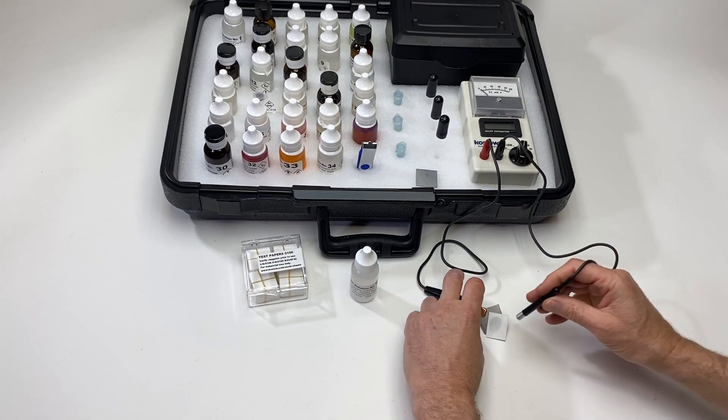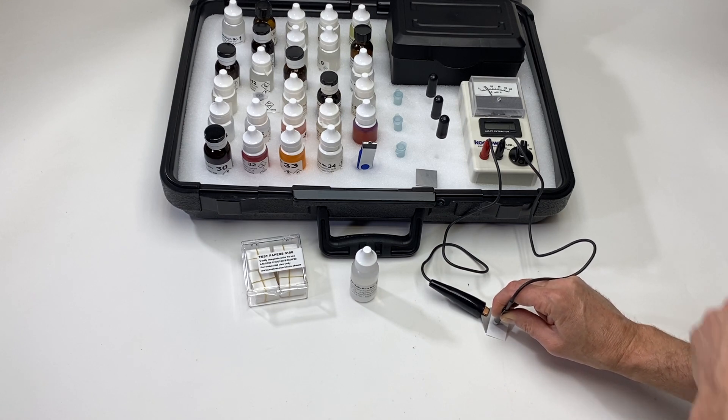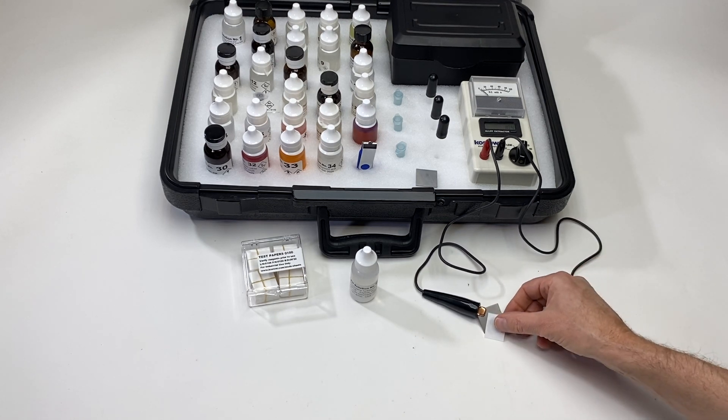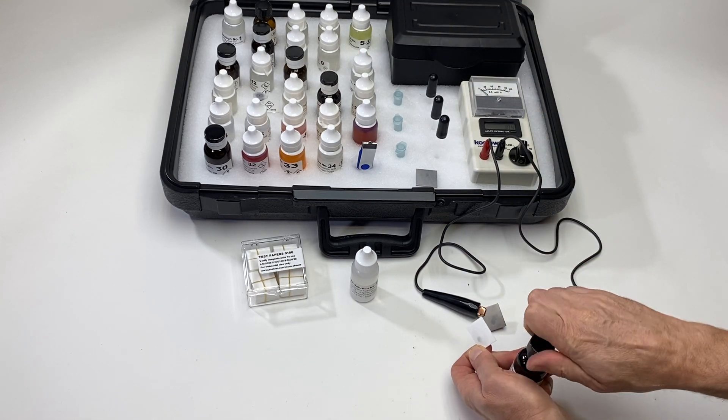Then the electrospot process for 10 seconds. I'm on medium and you can either count out loud to 10 or observe the count-up timer. 9 and 10 seconds — that's 10 seconds. Then we're going to add a drop of solution 10.